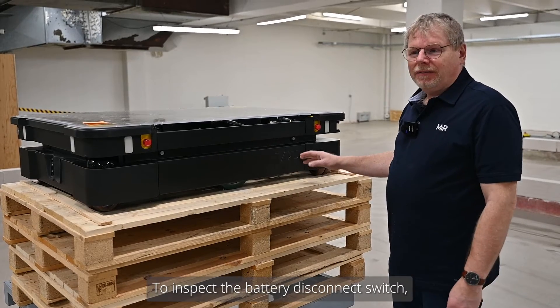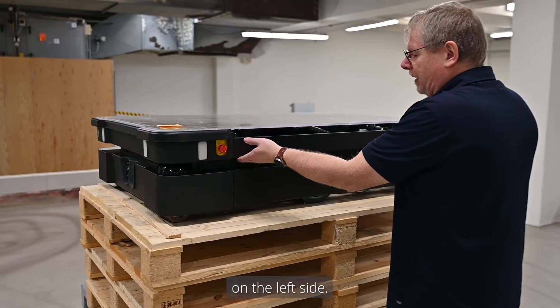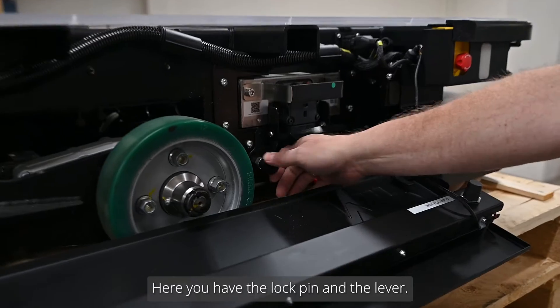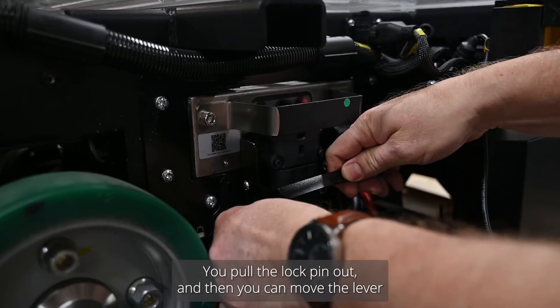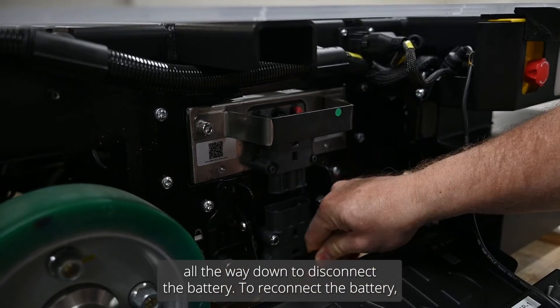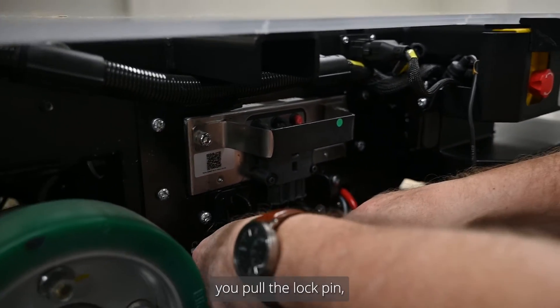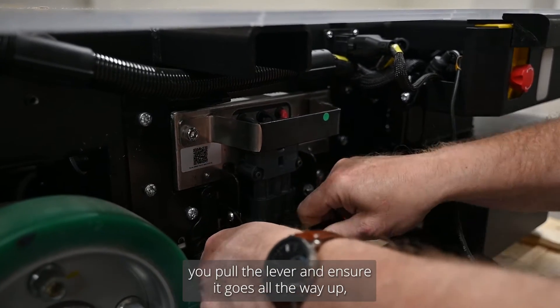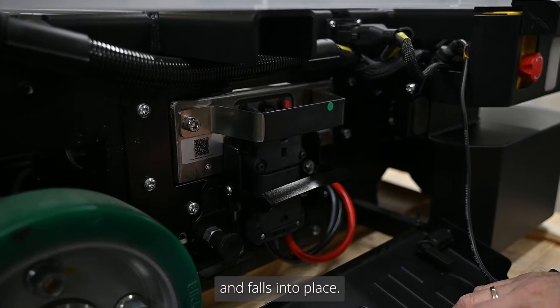To inspect the battery disconnect switch, you first need to open the side cover on the left side. Here you have the lock pin and the lever. You pull the lock pin out and then move the lever all the way down to disconnect the battery. To reconnect the battery, pull the lock pin, pull the lever, and ensure it goes all the way up and falls into place.